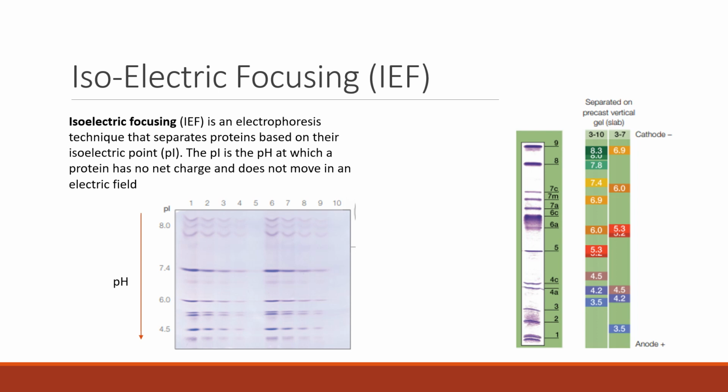This is a technique that's often combined with the SDS electrophoresis, and creates a very powerful separating tool that we'll talk about a little later on.